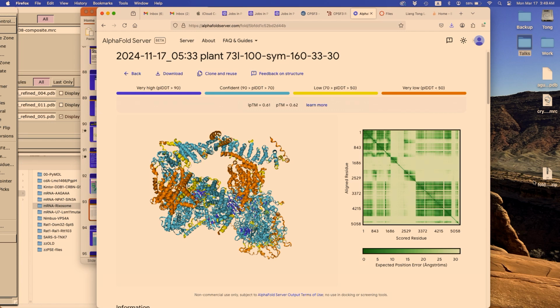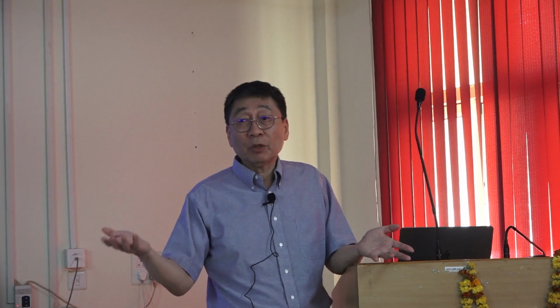So again, you need experimental data. I'm an experimentalist, so I will say you try to get some experimental data. In this case, maybe you can put it into AlphaFold 3 and see whether you can predict the complex between your protein, that linker region, and the DNA, whether it makes sense or not. Once you have a model, if you feel it's real, the next thing to do may be mutagenesis or binding assays, all that stuff, to assess it. And that's something we do as well.